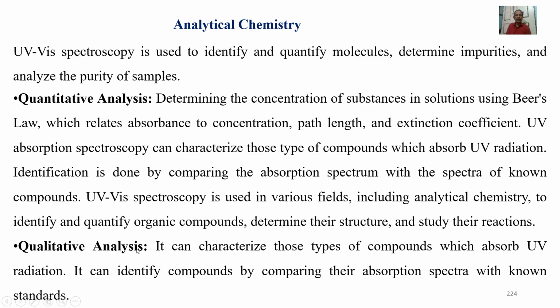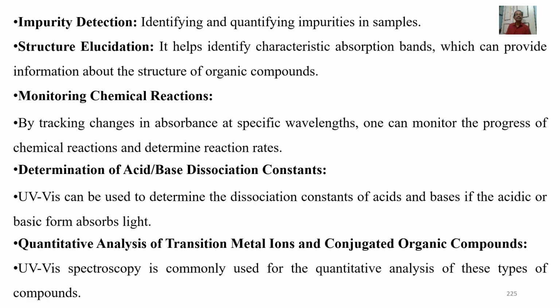Qualitative analysis. It can characterize those types of compounds which absorb UV radiation. It can identify compounds by comparing their absorption spectra with known standards. Impurity detection. Identifying and quantifying impurities in samples. Structure elucidation. It helps to identify characteristic absorption bands which can provide information about the structure of organic compounds.